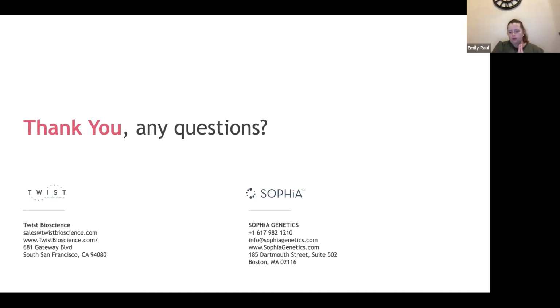Sure. So as with any part of any exome assay, we're going to see the possibility for false positives and false negatives. But as we developed this assay and really looked to orthogonally confirm CNVs, to be confident in how we develop this, we're able to zoom in, to target what we look at and minimize those. Now, we do still see some labs that look for orthogonal confirmation from their MLPA assays or whatever they may run. But we also see the confidence growing in our labs that run exome-based solutions, where they are less likely to do that orthogonal method because they have the confirmation. So of course it is always possible, but typically this goes back to that idea of confidence that I mentioned. We will reject regions rather than call them with a false positive or a false negative.